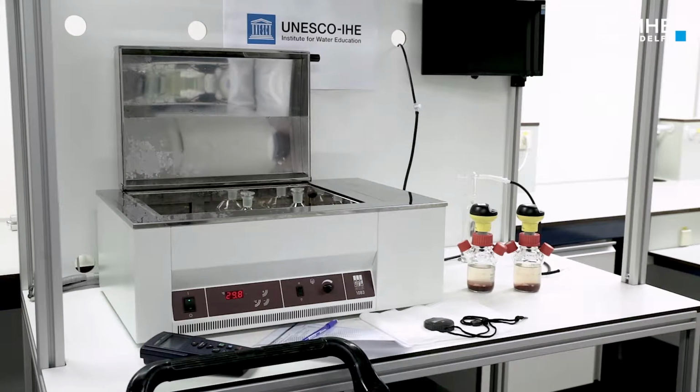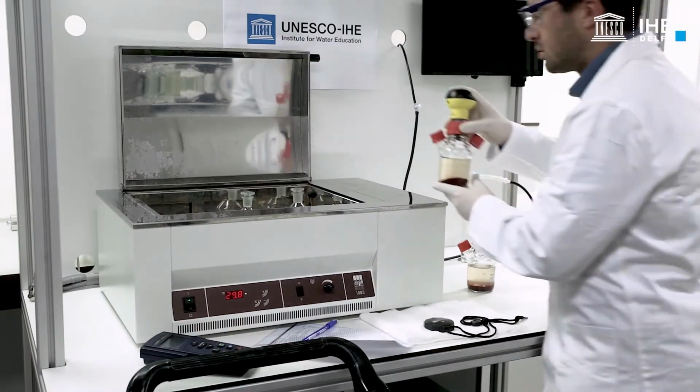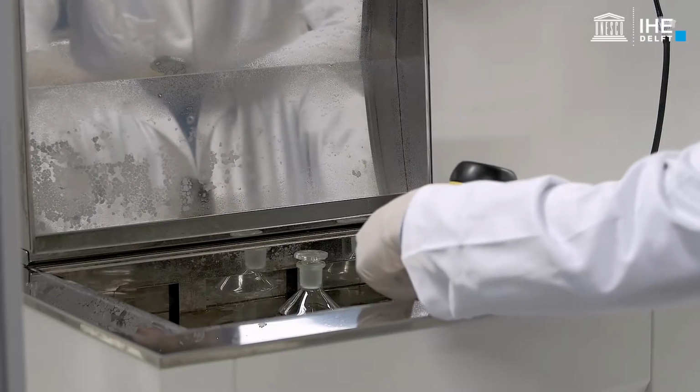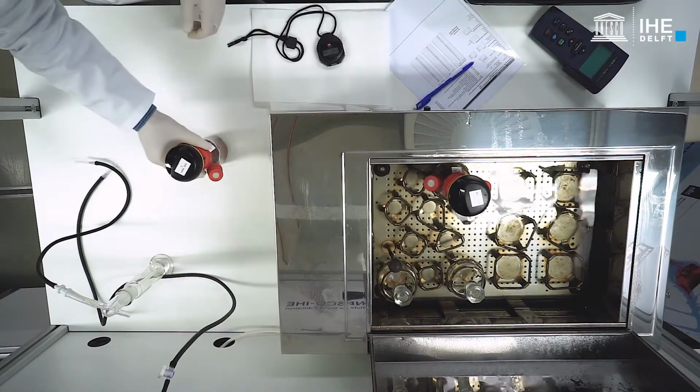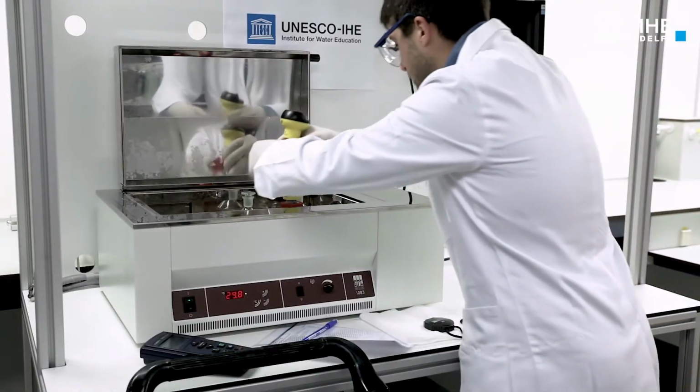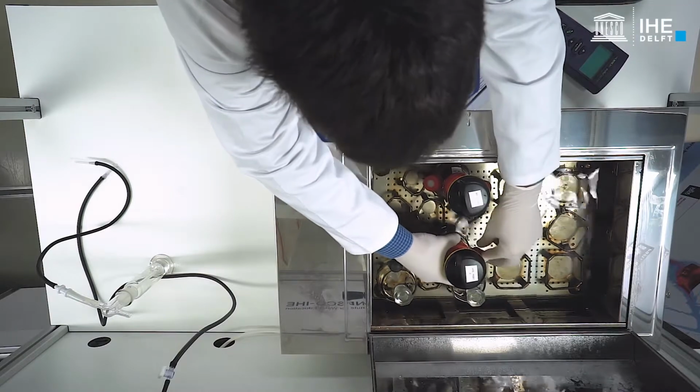Place the reactor vessel in the incubator and start the shaking. Check that the sludge is well mixed without sludge stratification or dead volumes, and that the mixed liquor does not get in contact with the pressure transducer. Otherwise, increase or reduce the mixing speed, respectively.